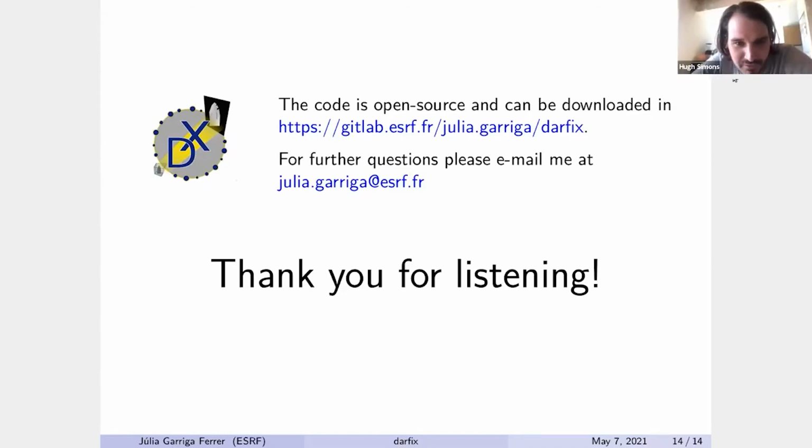Yeah, Julia, this is absolutely incredible. And I think I can say for anybody who's ever had to wade through my terribly hacked together MATLAB scripts, the amount of time this is going to save everybody, myself included, it's just amazing. You've really done, by the look of it, a fantastic job, and I can't wait to test it out.